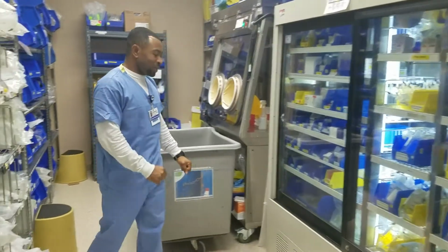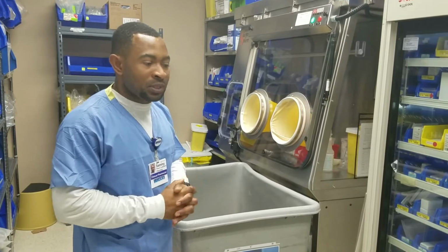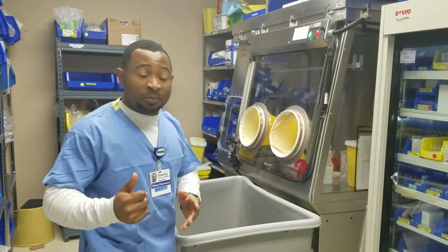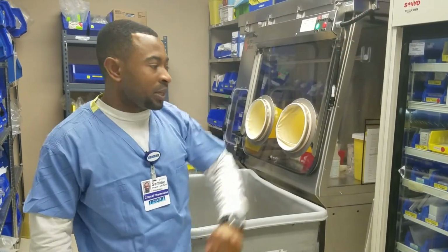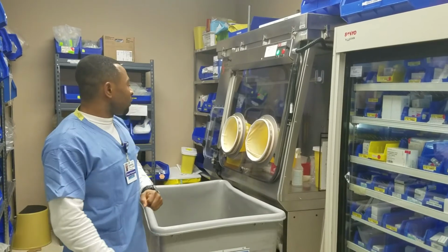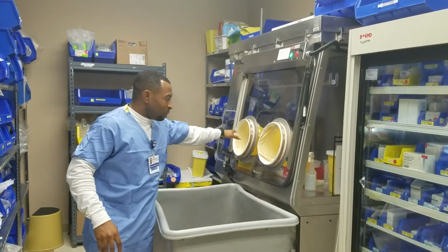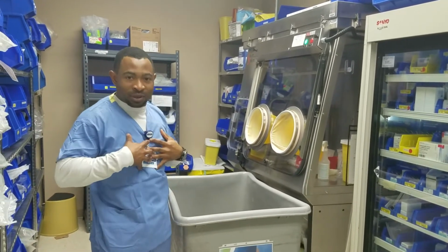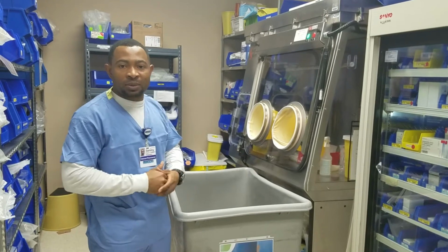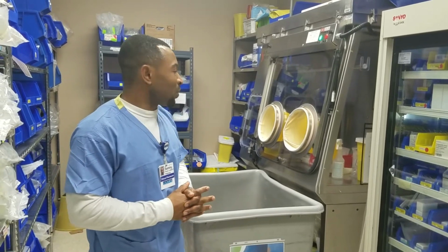One other thing I will show you here, we don't do a whole lot of chemotherapeutic agents here in our hospital at North Suburban, but from time to time we do get a few chemo agents to prepare for some of our patients, and we don't prepare those in our clean room there. We have a special cabinet, a biological safety cabinet, that we use for preparing most of those chemo agents, and it has glove boxes and everything just to be sure that the technician making the medication is not exposed, or limits exposure, to those chemotherapeutic agents. Like I said, we don't do a whole lot of it, but once in a while we do get a few.